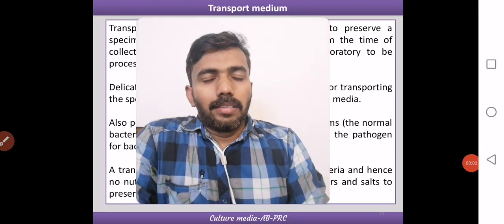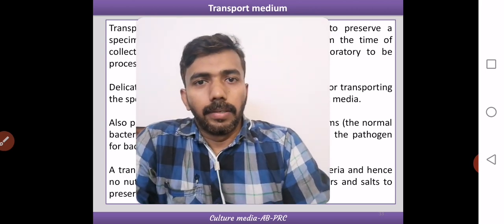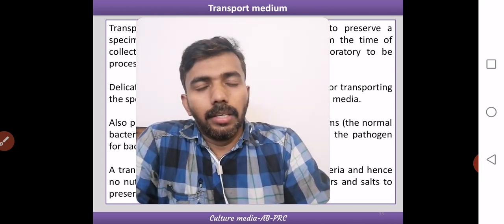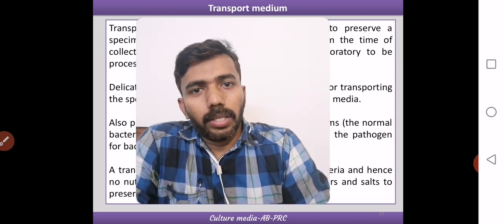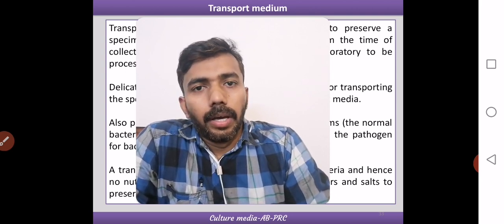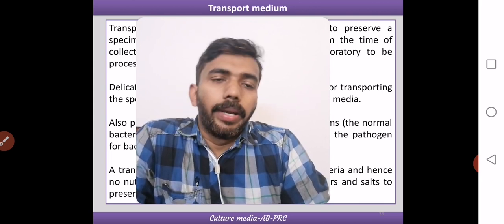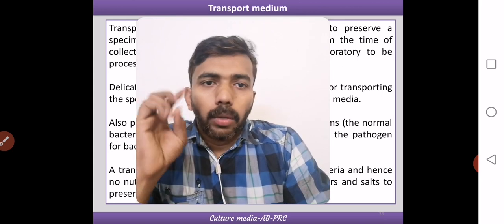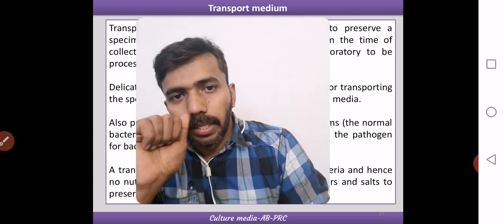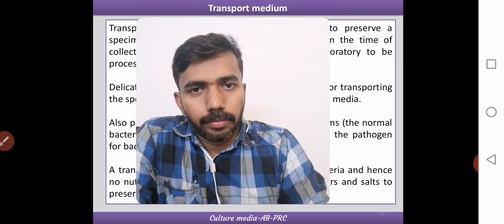Welcome back, friends. So, we are moving into the next part of culture media. In the previous discussions, we have seen the different types of media or the classification of media based on various criteria. And now we will discuss the remaining classes, especially the transport media, the anaerobic media, the sugar media, and also the indicator media. So these are the four types of media we will address in this part of the presentation, right?